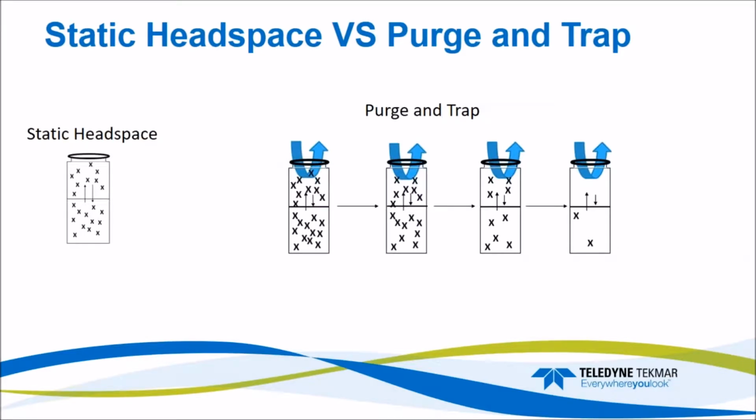In the case of static headspace, seen on the left, samples come to equilibrium and the compounds of interest go from the liquid to the gaseous phase, and once that equilibrium is reached, meaning no more net transfer is occurring, an aliquot of that headspace is taken and analyzed.